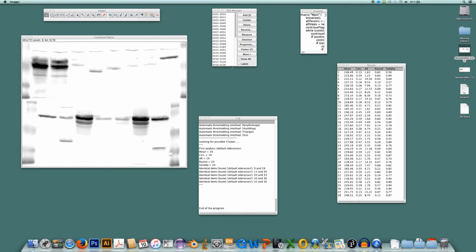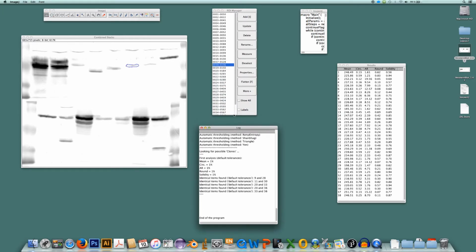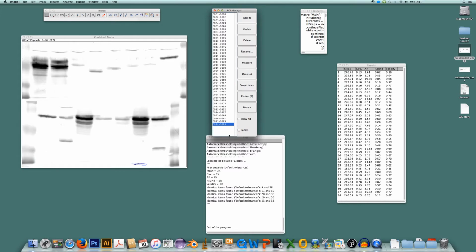I open up this list here. Okay, so it's number 9 and 28, so let's go to number 9, which is here, and number 28, which is here, and they look very identical, these two.